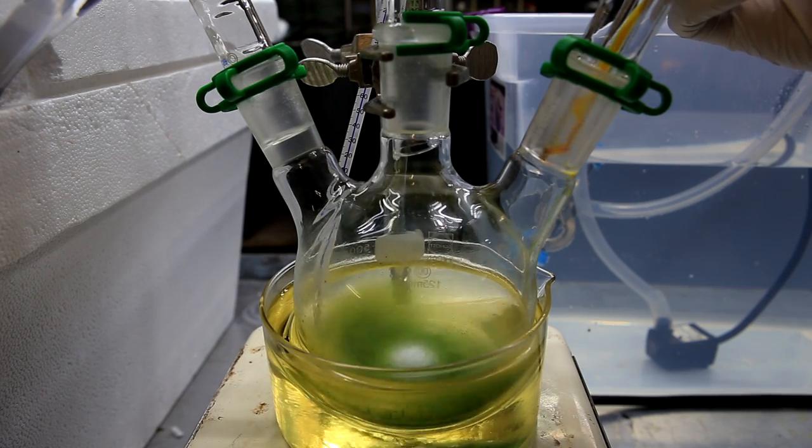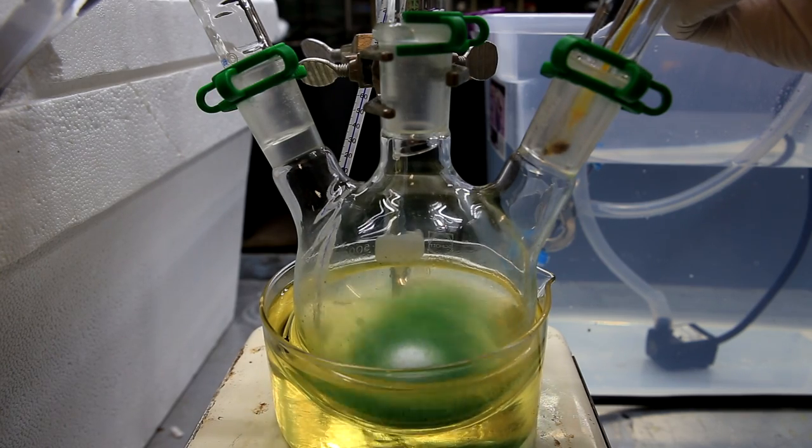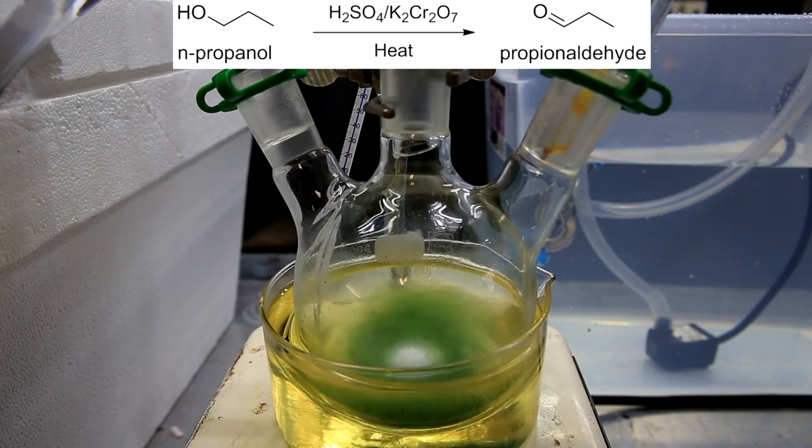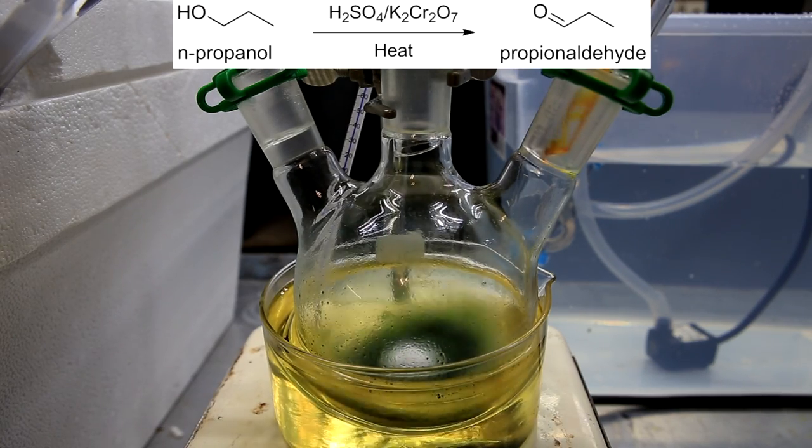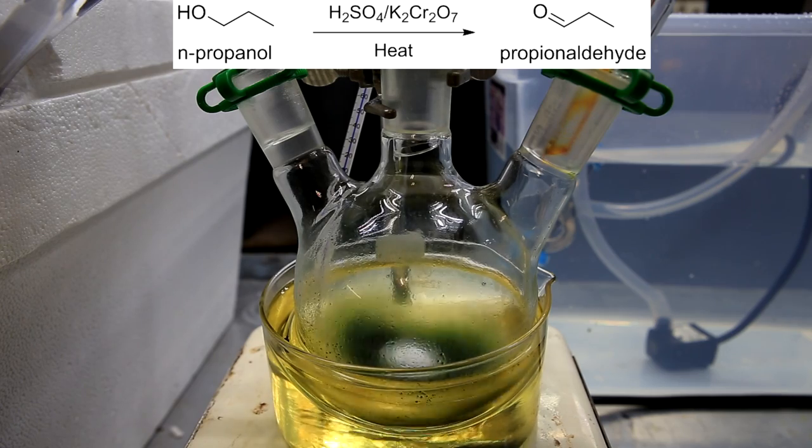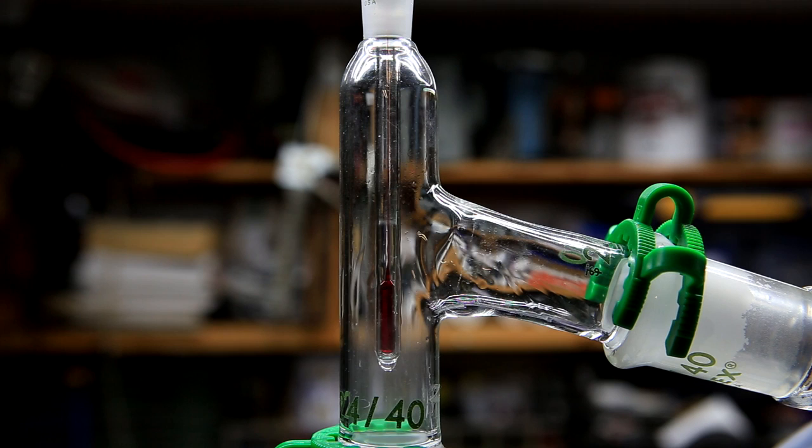To keep up a vigorous boiling of the reaction mixture, it's important to add the chromic acid solution slowly. The reaction occurring is shown above, where the n-propanol, which is an alcohol, is oxidized by the sulfuric acid-potassium dichromate mixture to the corresponding aldehyde.